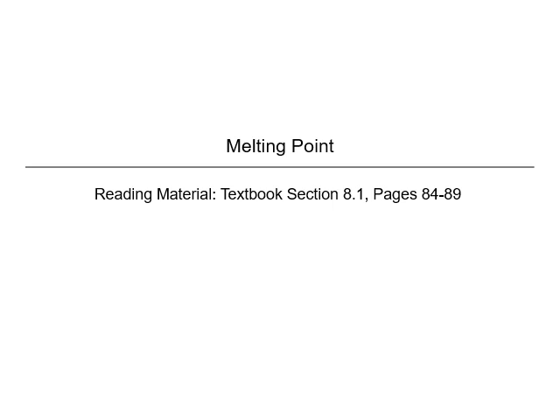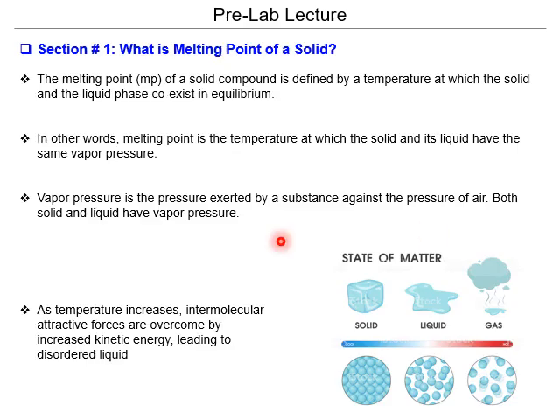Today we're going to talk about melting point concepts and the procedure which you can use to measure the melting point of some compounds. So, at first, about the melting point.